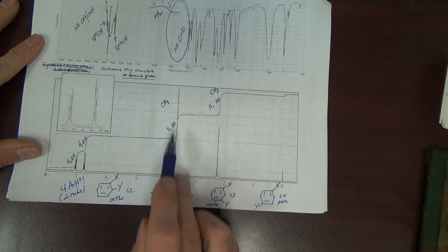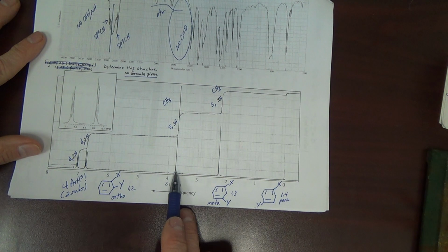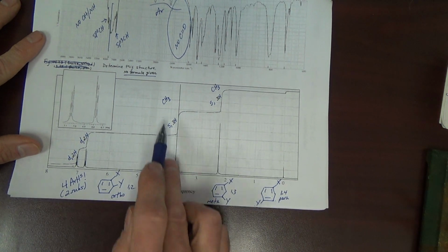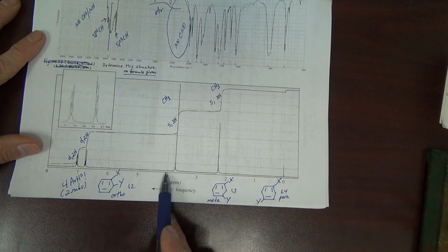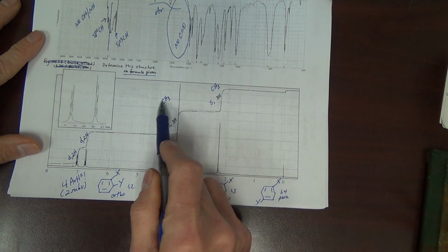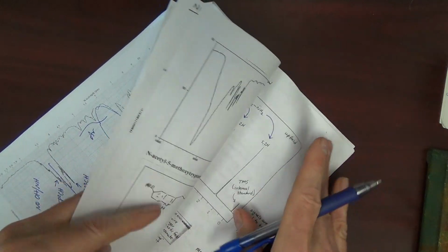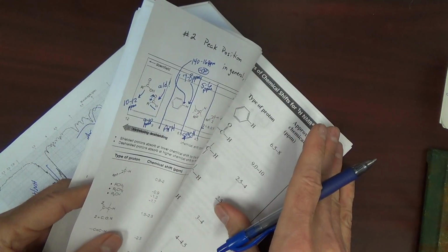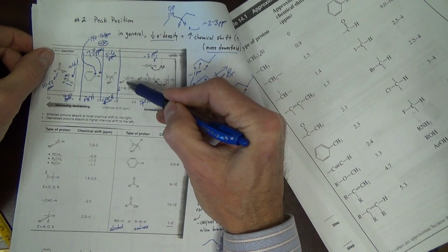One of them is more downfield. Now, this is in that 3 to 4 region. What would make this signal for this methyl so far downfield, almost 4 ppm for a saturated CH? All right. Right here.